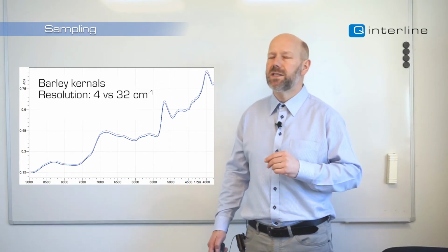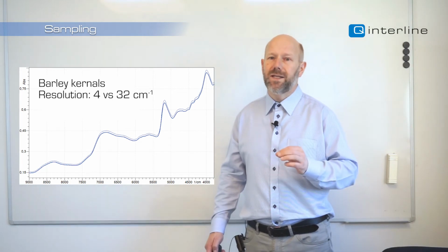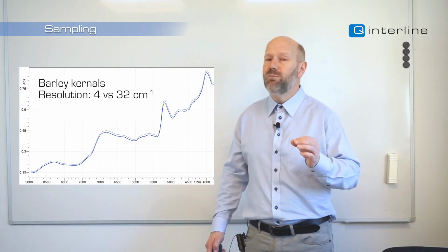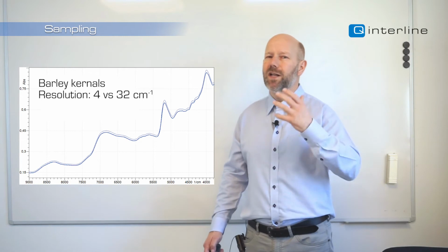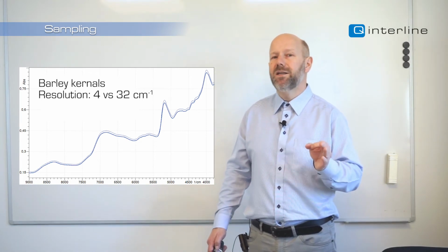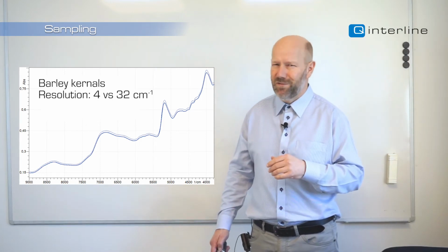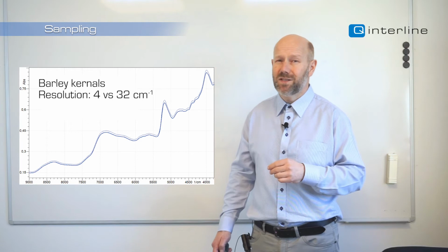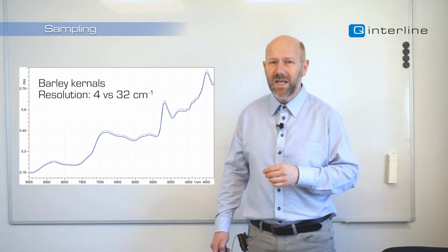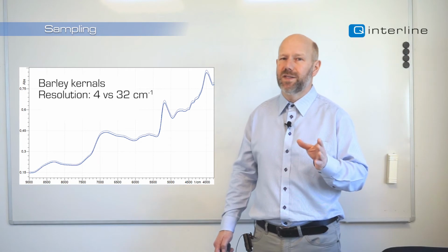My favorite is 16 or 32 because I get very low noise, and you may be tempted to say I want to have a lot of data just to be safe, but in this case more data is not safe. It's actually, here it means you're sorry. Let's go back to the spectra and observe this.